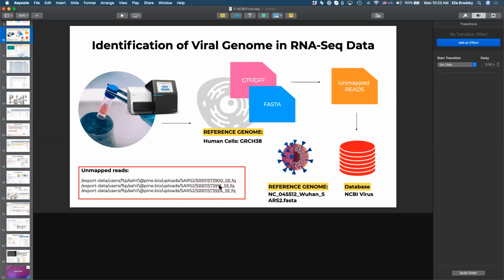So that's why we're asking everybody to, first of all, try the examples that we provide you with. Those examples are typically going to be on data sets that we have validated that they work, and they have predictable outputs from those analysis pipelines.